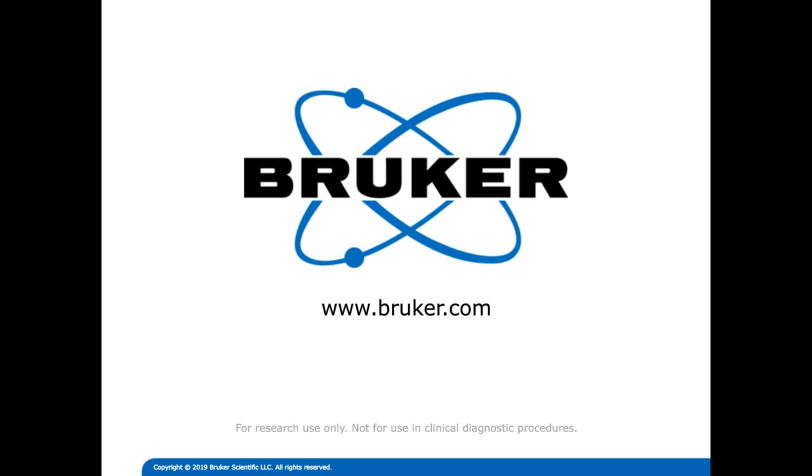So this one asked, can one of the shown instruments differentiate between a PS-PO exchange and an AG exchange? Yes, I believe there was a slide. I think this was on the electrospray instruments, the compact, and it is possible to differentiate between the PS-PO exchange and also the AG exchange.